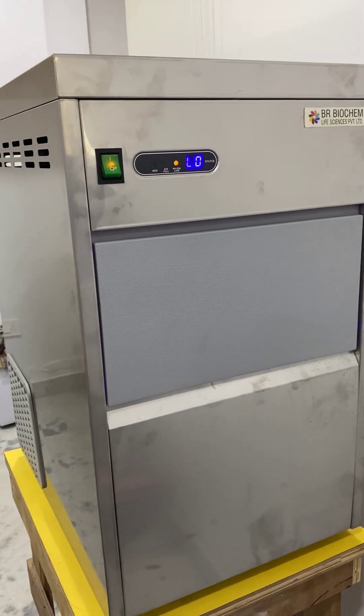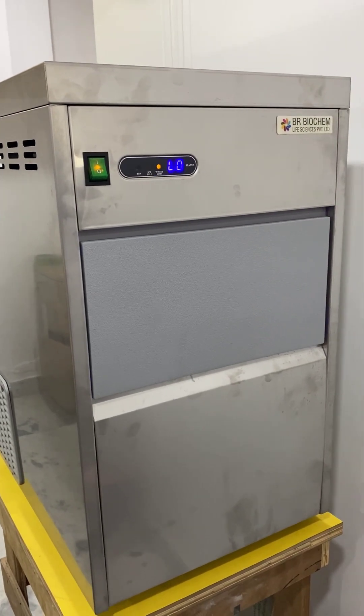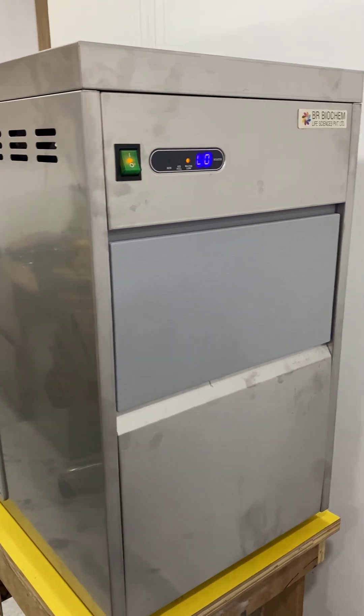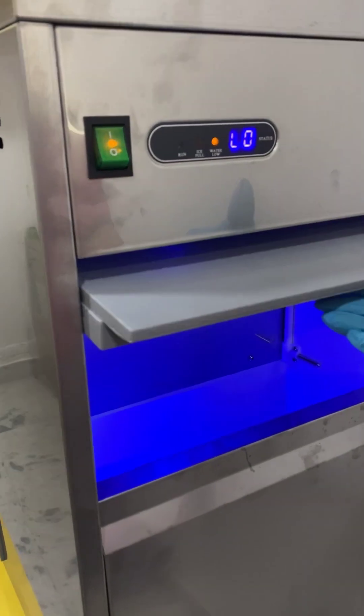The storage capacity of this machine is 15 kg. As you can see, this is the inner part of the ice flaking machine, having good quality plastic material. The refrigeration type of this machine is air cooling.